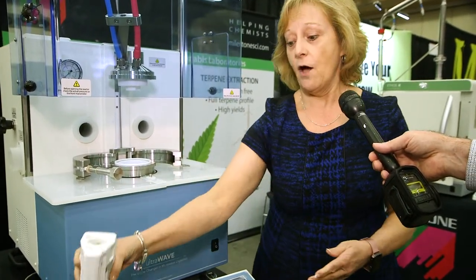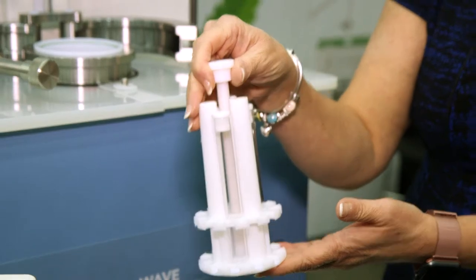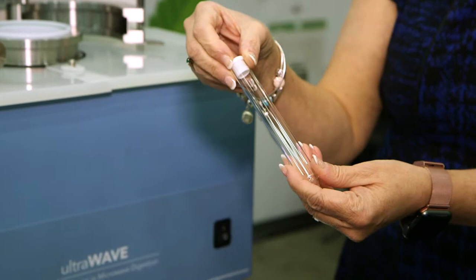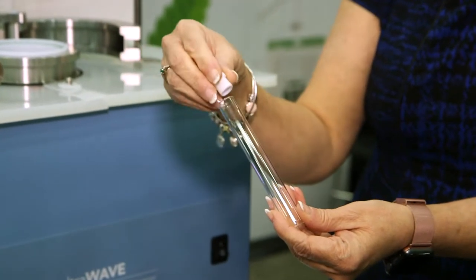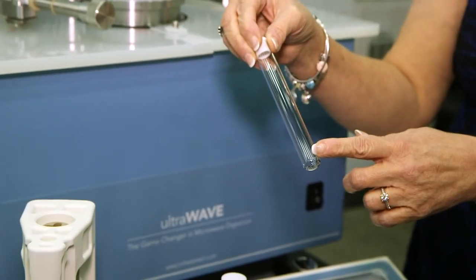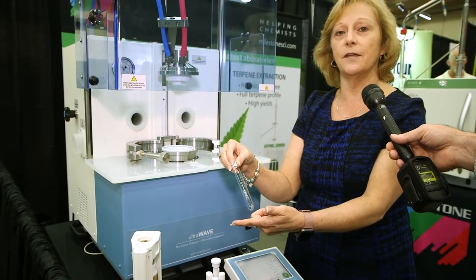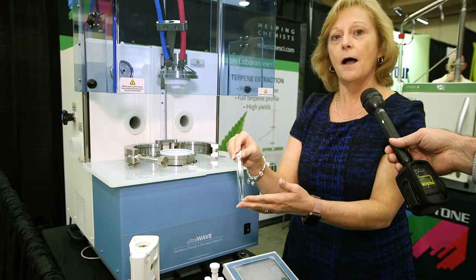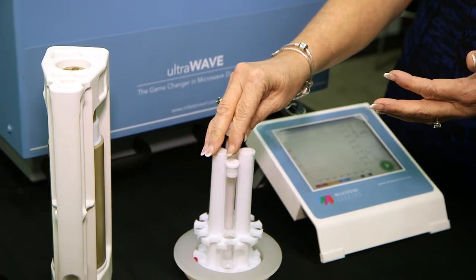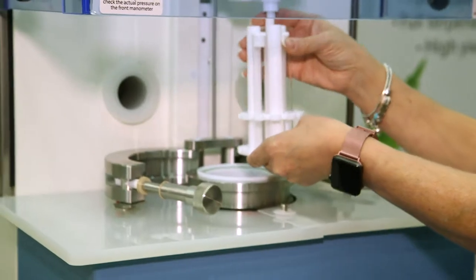In comparison, for the ultrawave, we actually use these sample vials — a disposable glass vial with a loose-fitting cap. The same weight of sample, along with the same amount of acids, can go right here in this small vial, as can go into the larger vessel used in rotor-based systems. This is placed inside a sample holder, along with 14 other samples, and then placed inside the ultrawave.